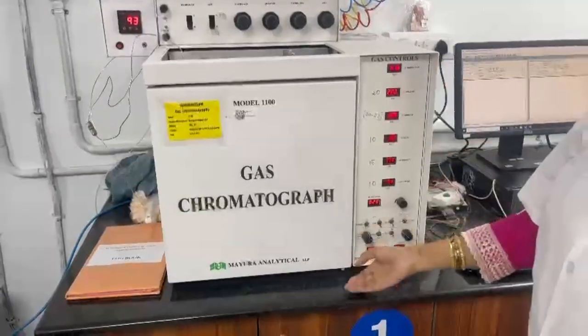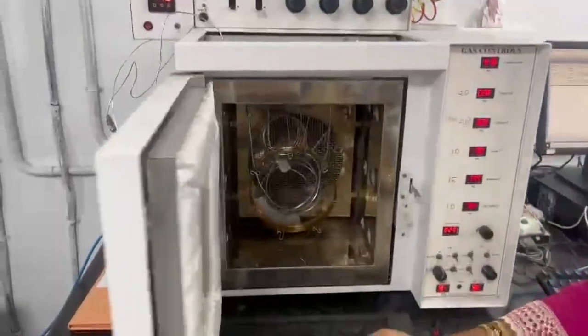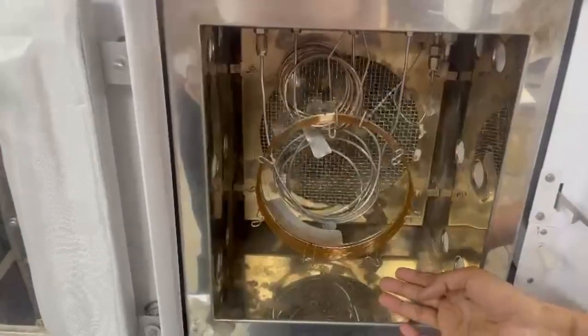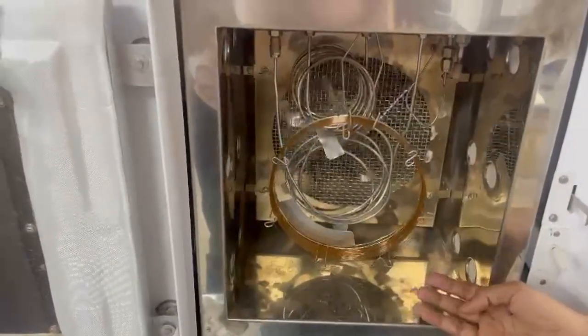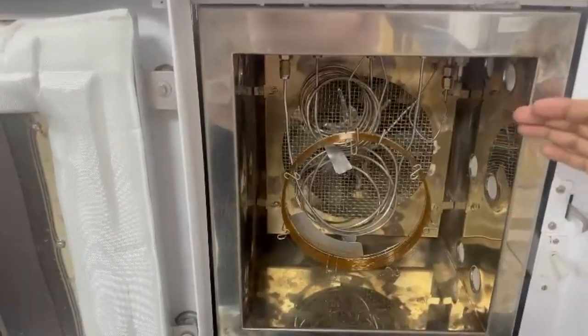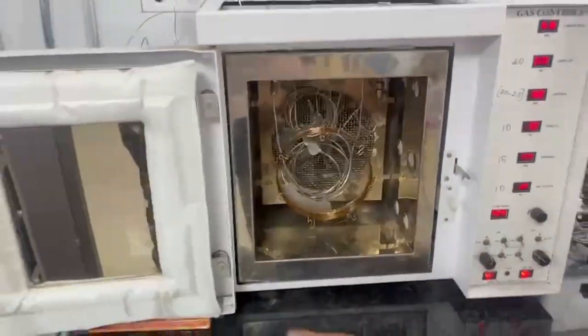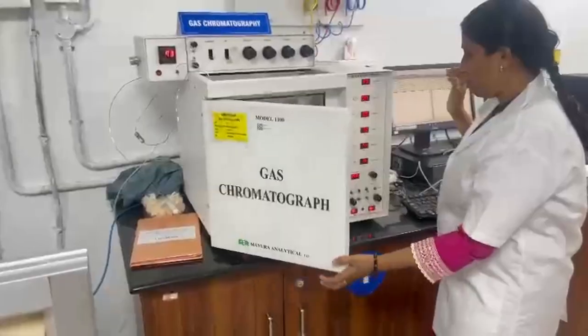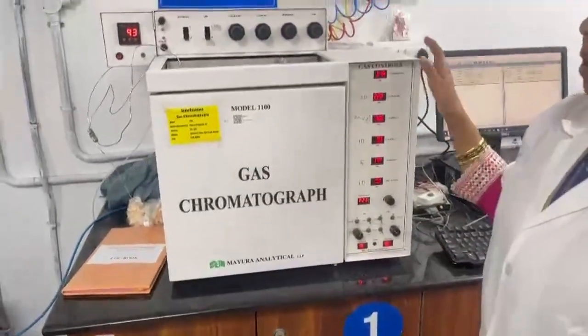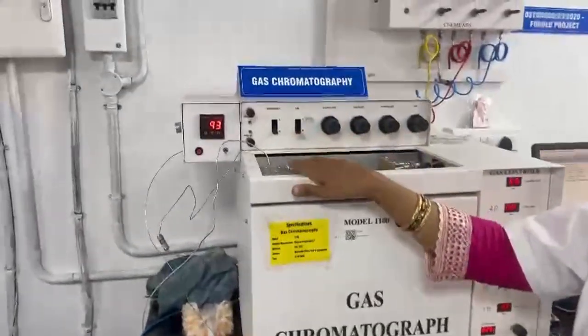We have two different columns, a capillary column and a packed column. For the capillary column, argon is also used as the carrier gas, and the packed column is connected in series and it is connected to the detectors. Apart from that, we have an injector.